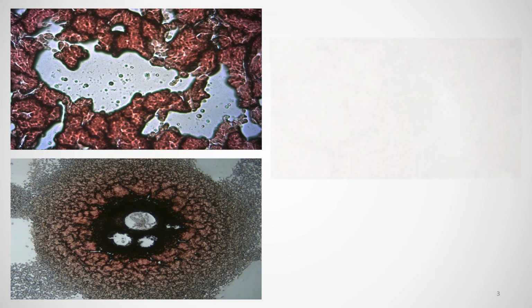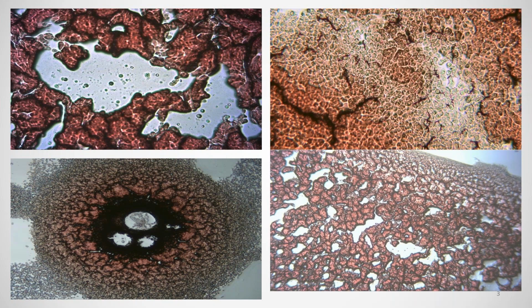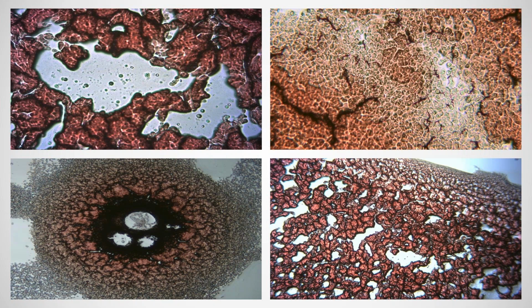All right, so these are actually dry blood samples that we're looking at. That's the other type of test. It's a different sample that's taken from the same pinprick of the finger, and the blood is allowed to dry there. And there's various anomalies that we can see there that can't be seen in a live blood sample. So the two tests work very well together, a good combination to actually do both. We get a very wide range of information. Now, there's of course a typical healthy dry blood sample, and then of course these are some of the abnormalities that we can see.